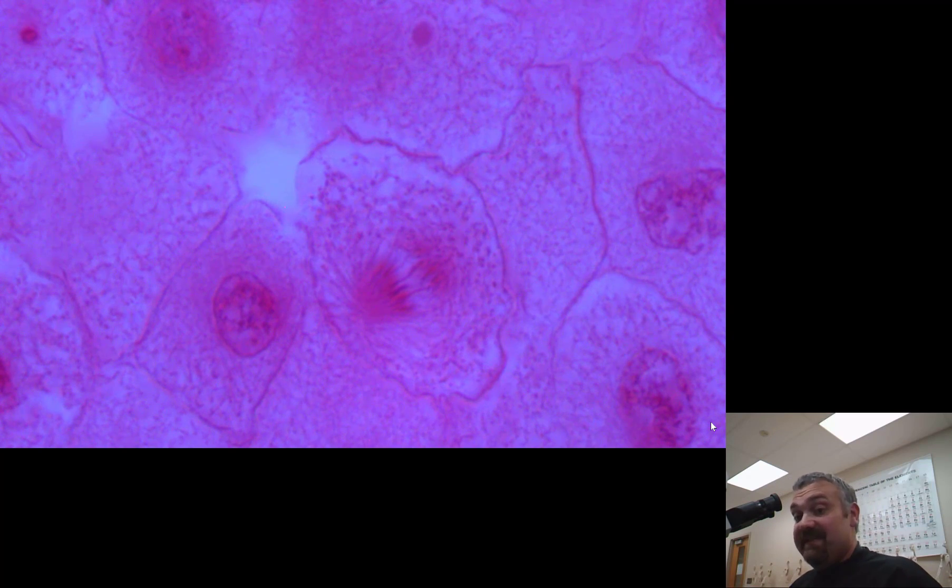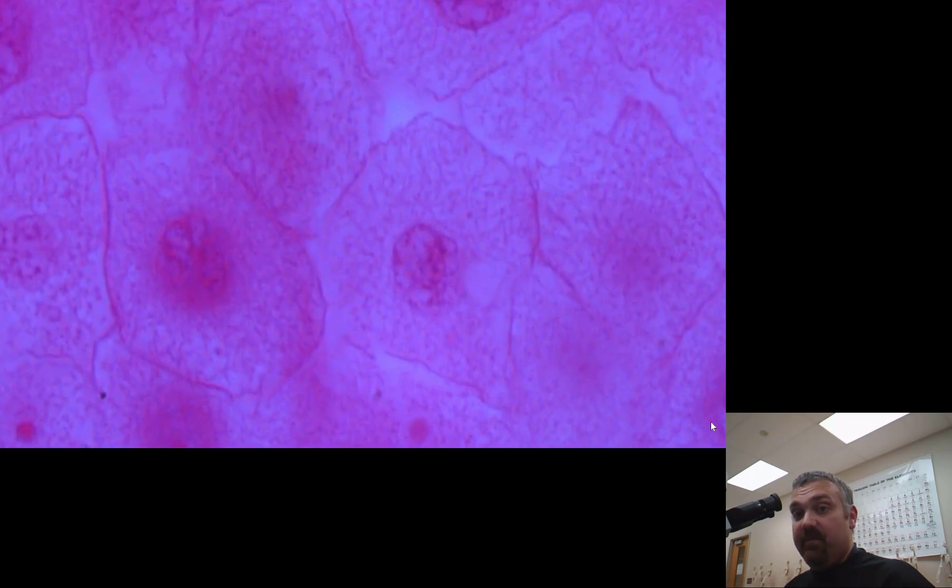You are seeing how every cell is created. Every cell is created from a pre-existing cell like this using cell division or comes from a stem cell. But stem cells still have to undergo this process. You are seeing the creation of new cells right here under the microscope.